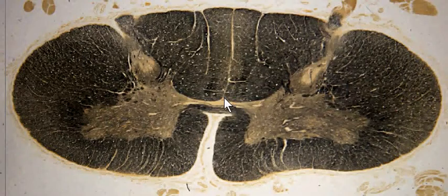Hello again, this is Dr. Brain. We're now going to begin the last portion of our neuroanatomical study. The very first slide of this study was a portion of the upper cervical cord around C2. We're now moving caudally in the cord, and this slide is approximately at C8. Let me point out the structures and then we'll come back to review function briefly.